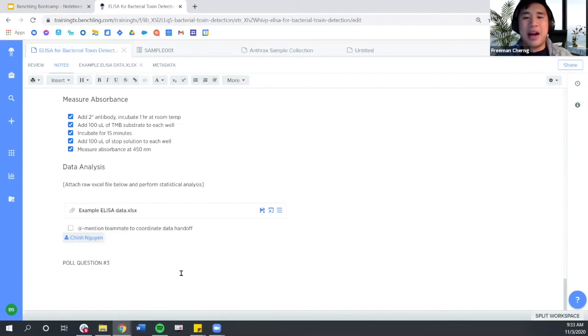So of course, be mindful in your mentioning, so your teammate isn't getting 20 emails a day from mentions. But I want to point out that this tool is very powerful in communicating with team members that you want their eyes on a particular entry. I remember that anytime a colleague and I want to discuss the results from, for example, our NADH glow assay, it will start out with an email that I have to attach the file to and multiple back and forths on one thread.